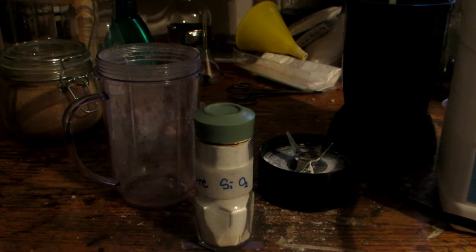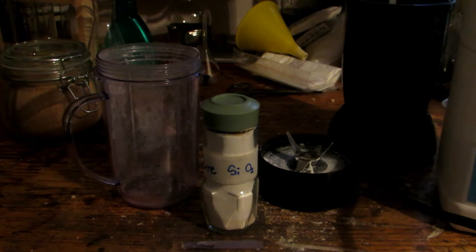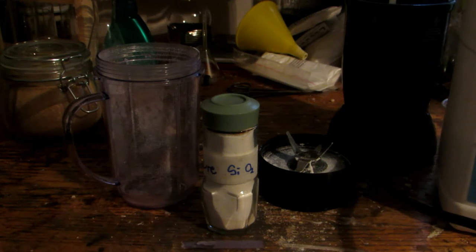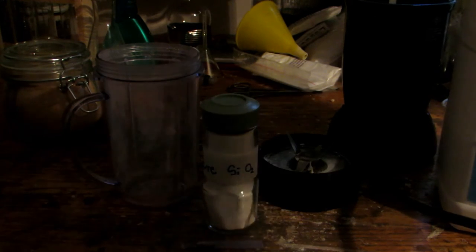Now upon mixing these two and then heating them up very hot, you get the formation of sodium silicate and water, which goes off as a gas. So what we're going to first be doing is measuring out the silicon dioxide. I ran through the stoichiometry, and for every gram of pure silicon dioxide you have, you need approximately 1.33 grams of sodium hydroxide.